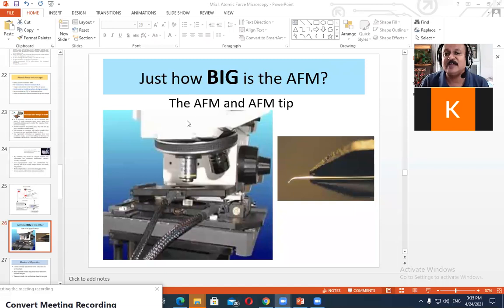That is to say, we can observe the object in real time. So for example, if you are trying to see phototaxis or chemotaxis, that phenomenon also you can probably see.